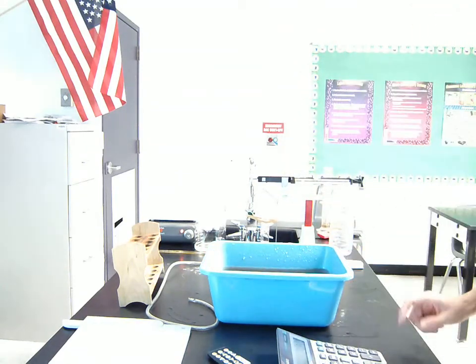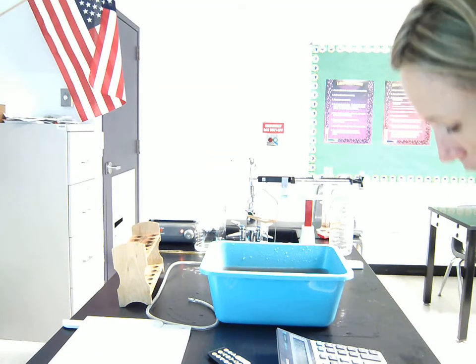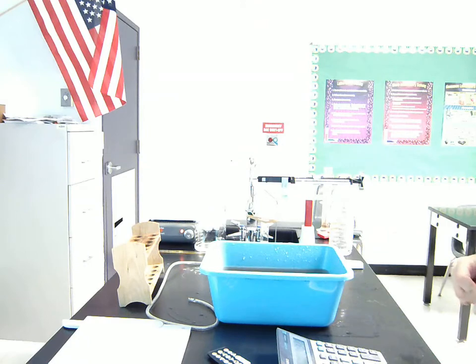44.123. Let me just double check that. 44.123. Okie dokie. So that's my ending mass.